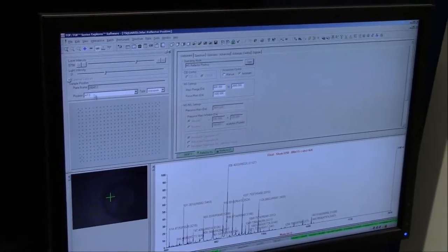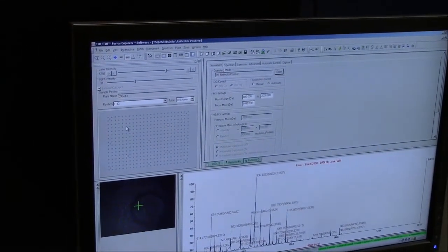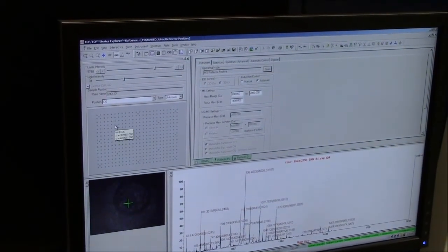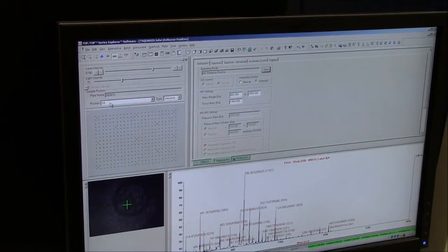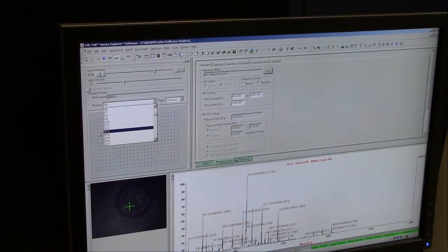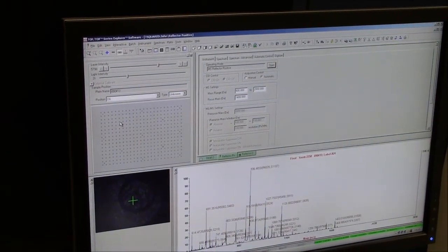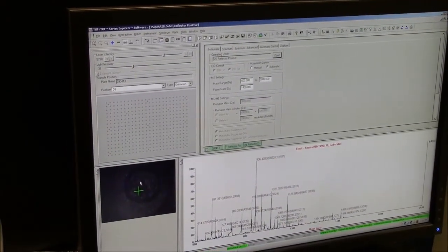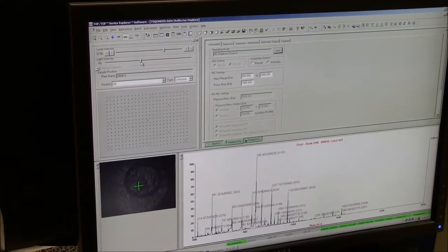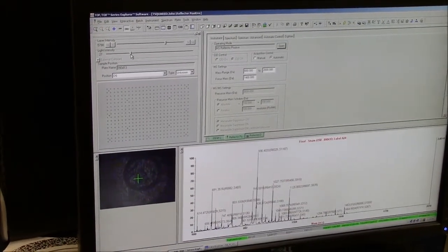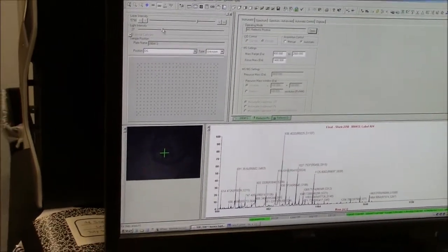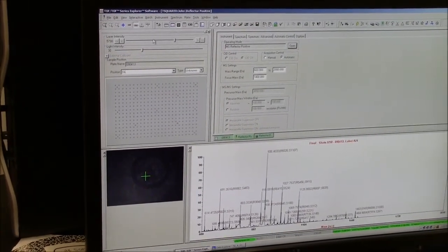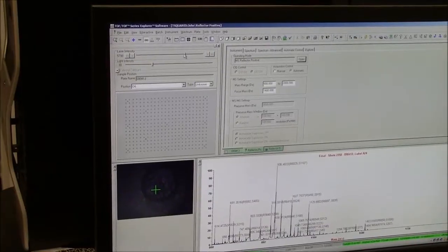So we go over, so here's the position. You guys are doing what, D6? So you can just come up with it on your own, you know, it's the alphabet and the location. Or you can click on the position on here. Both are fine to move around the plate. You can see the camera there moving around the plate. You can turn up the brightness, the light intensity in there, but that just helps you with visualization. It really doesn't matter.